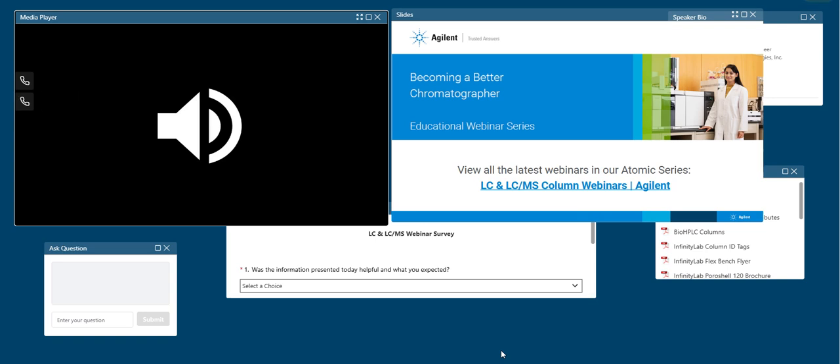Perfect. This question is asking, when performing the calibration, does it have to be done with every analysis?